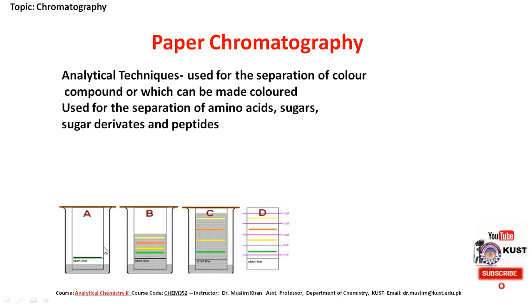This is a type of chromatographic paper. The stationary phase is water held on a solid support, filter paper, cellulose. The mobile phase is a mixture of immiscible solvents, which are a mixture of water, a nonpolar solvent, and acid or base. A butanol, acetic acid, water system or a phenol, water, ammonia system can be used as a mobile phase.